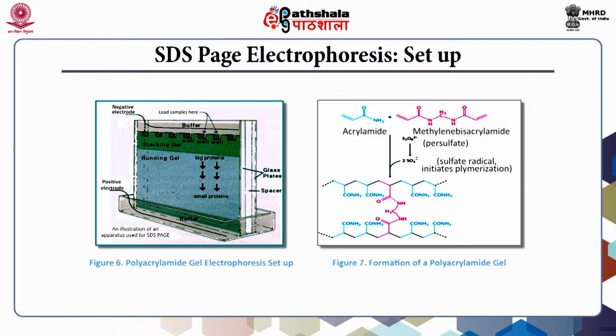Protein molecules that are smaller in size as compared to the pore sizes in the gel can readily move through the gel, whereas molecules larger in size than the pore travel comparatively slowly. Intermediate size molecules move through the gel at an intermediate rate. The direction of the movement of the protein in the gel is from the cathode to the bottom anode.